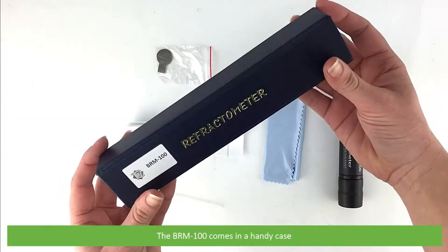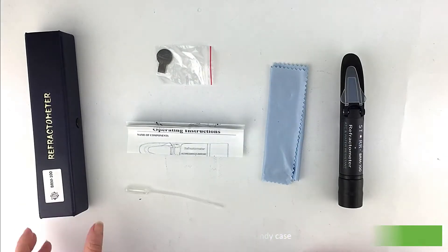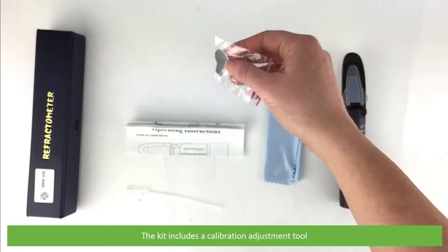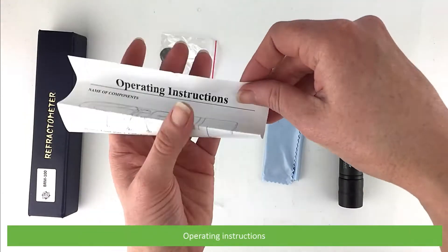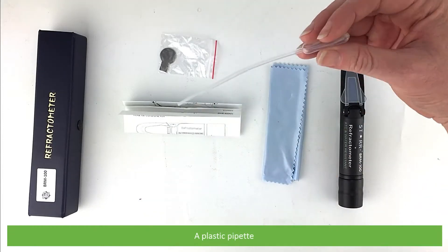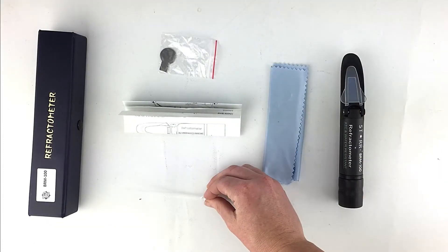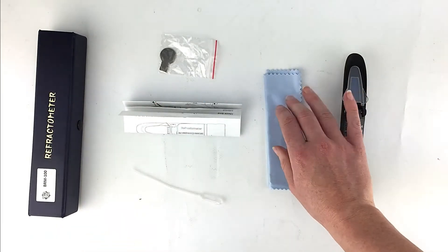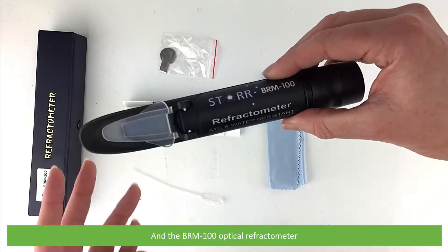The BRM100 comes in a handy case. The kit includes a calibration adjustment tool, operating instructions, a plastic pipette, a soft cloth and the BRM100 optical refractometer.